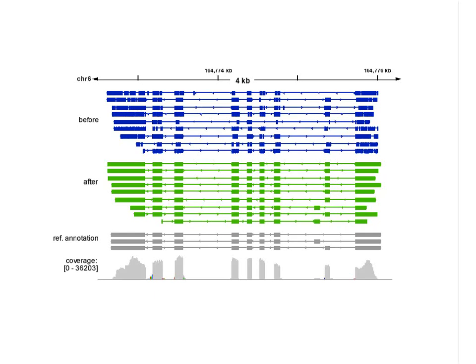And on the short read side, as long as it's a high accuracy read, we can use any technology. So we've presented results in the manuscript both correcting with Illumina, correcting with 454, and correcting with the PacBio CCS. In fact, the results using the PacBio CCS were some of the best of the results. It worked quite well for the correction. So you could do it all on one machine.